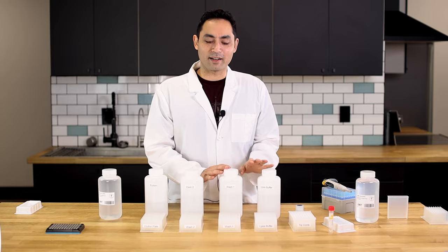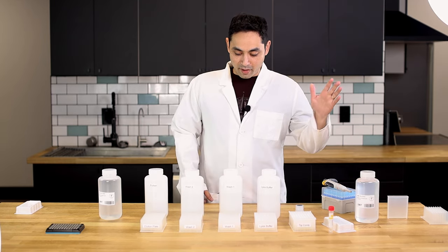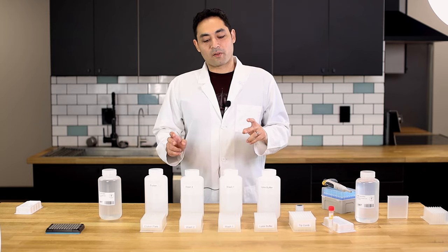All right, we're gonna talk about RNA extraction. We have different buffers here, we got the plates. There are essentially two ways to do RNA extraction: there is the automated way, and then there's gonna be the manual way with the mag plate. We're gonna go over both.